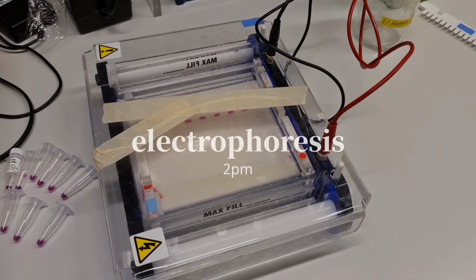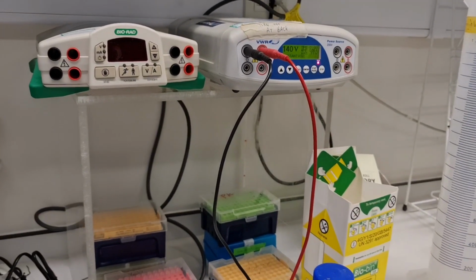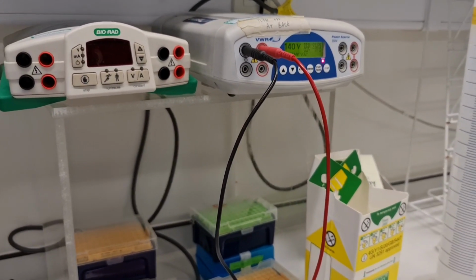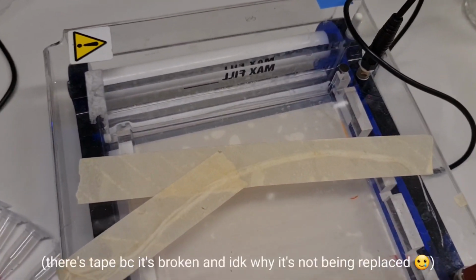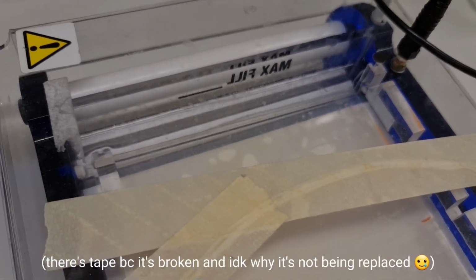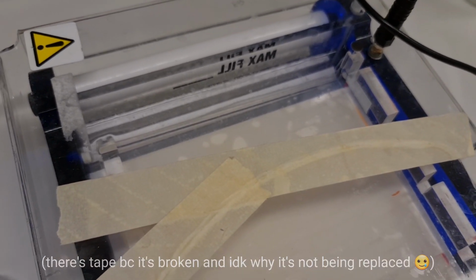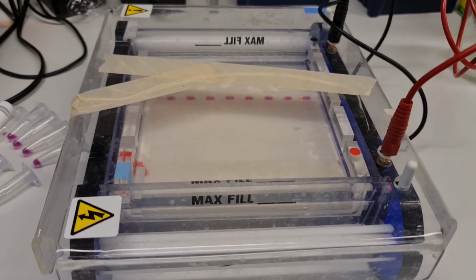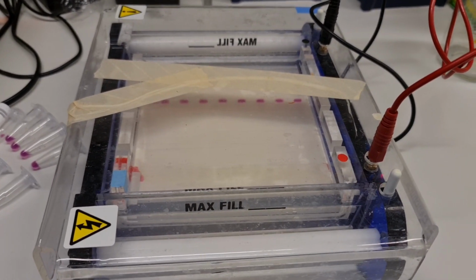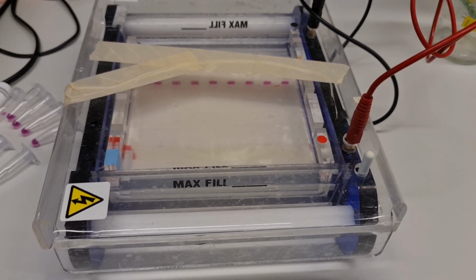So I've now set up my gel electrophoresis tank, and it's connected to this power source, and I set it at 140 volts. So once the electricity starts, you can't really see here, but there are little bubbles forming, and it means that the reaction is happening now. Once I wait for about an hour or so, those purple little lines there will move further along the gel, and they'll move down towards this red electrode, and then the experiment is complete.